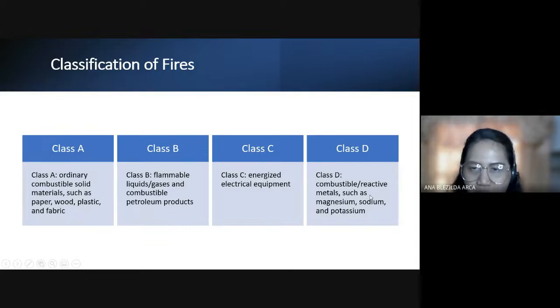So, in the laboratory, anong may encounter mo? Actually, this one, ito yung pinaka-common eh. Yung mga machines, electrical equipment, di ba? Besides that, ito rin, yung mga flammable. Okay? Ito, yung mga reactive na metals na yan, hindi masyado. Except if you are working in a research laboratory. Kung sa research lab ka or yung mga laboratory talaga for industry, ito yung Class D ang pwede mo ma-encounter. Pero kung hospital lang, is either Class B or Class C fire, di ba?